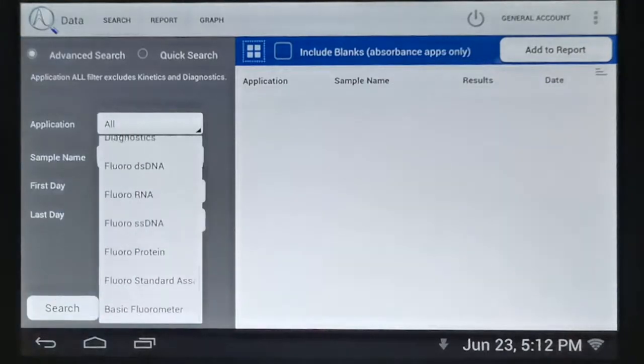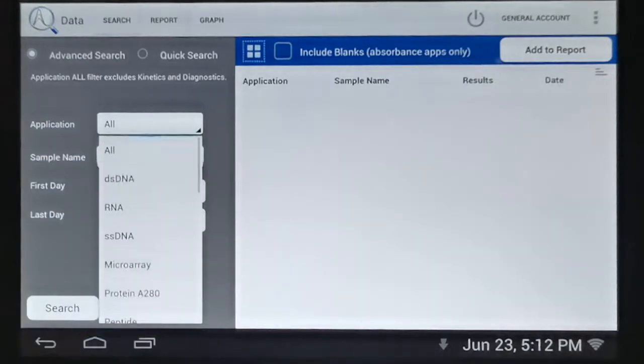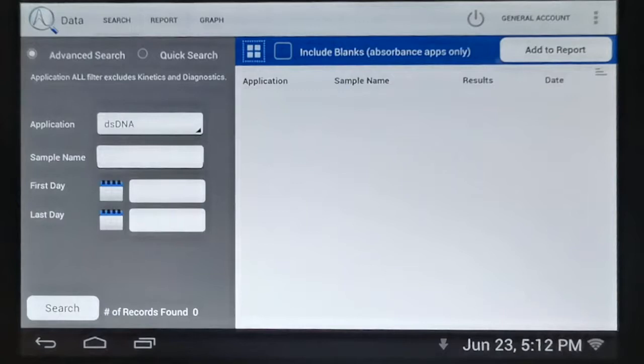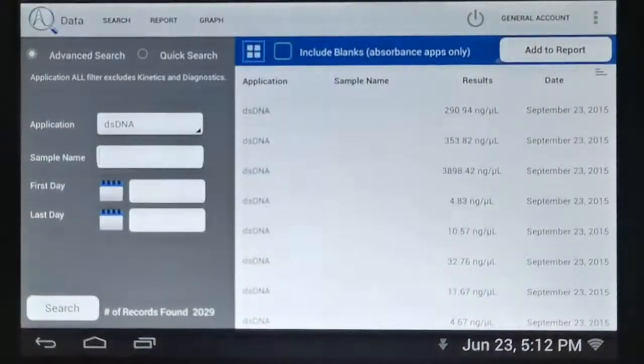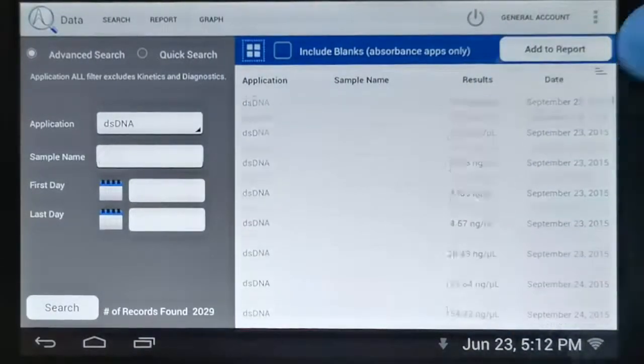By application, so we can select from a range of our applications here and just search within the data captured in those applications. We'll select double-stranded DNA. We could also search on sample name and on date range. And we'll just go ahead and search on all of the data on this instrument. You'll see it just takes a fraction of a second to search all of that and bring up all of the data that has been captured on this instrument.